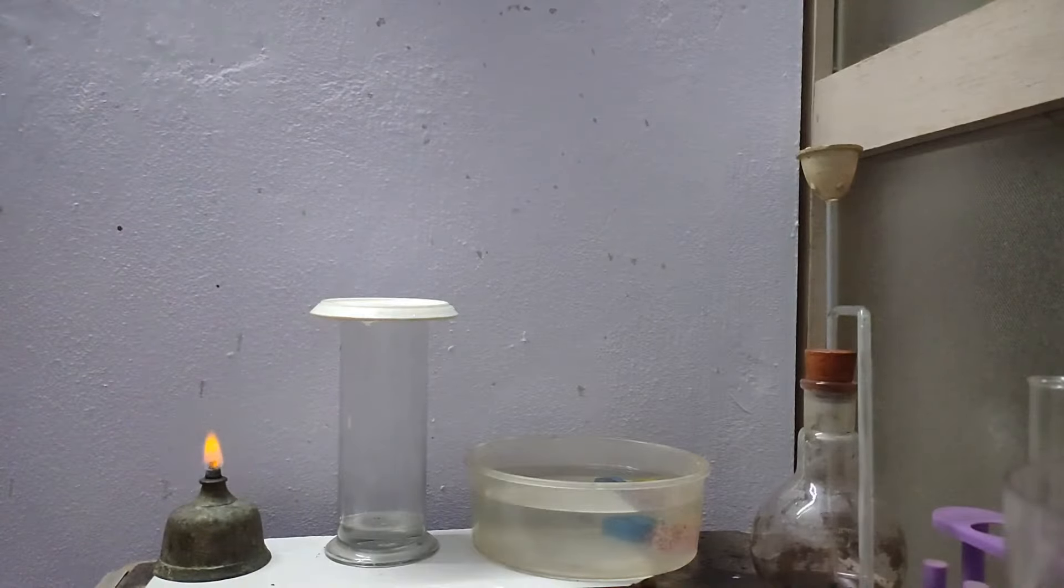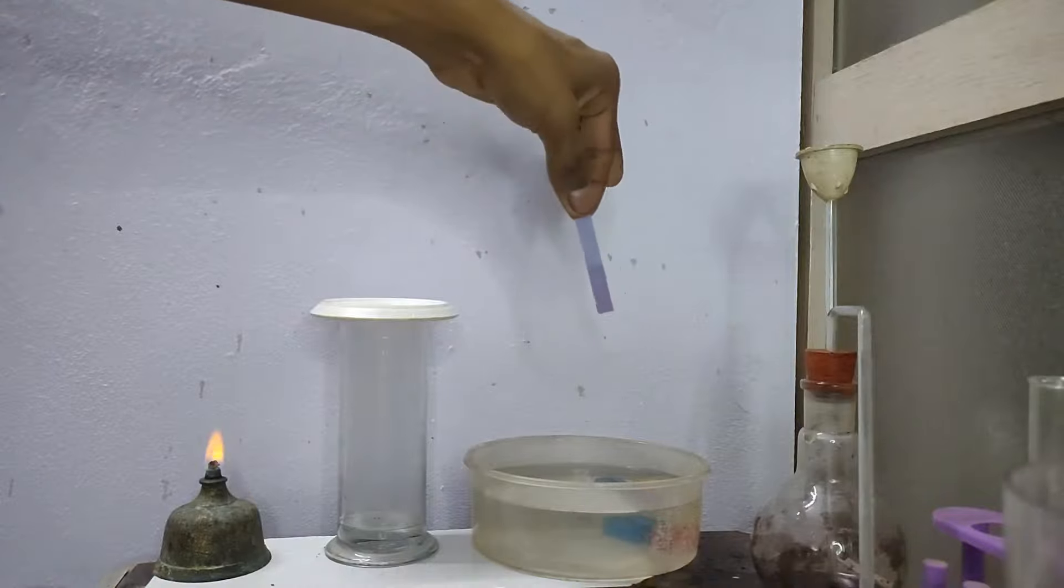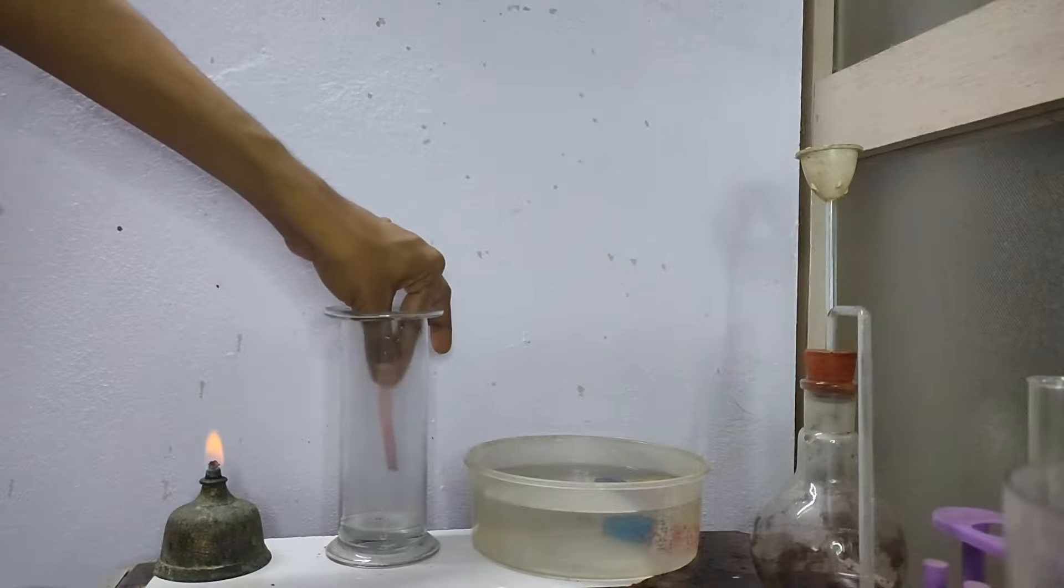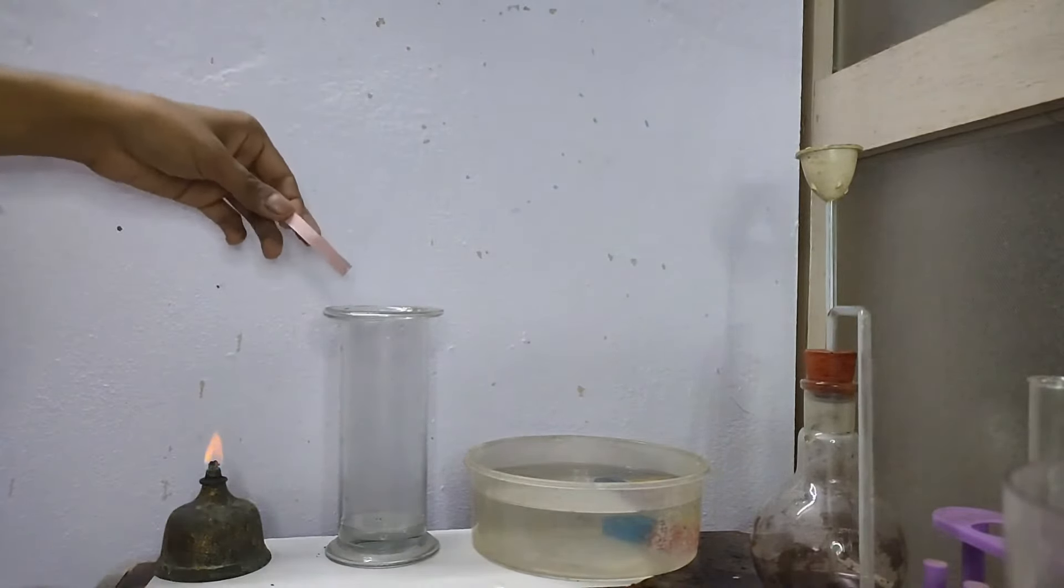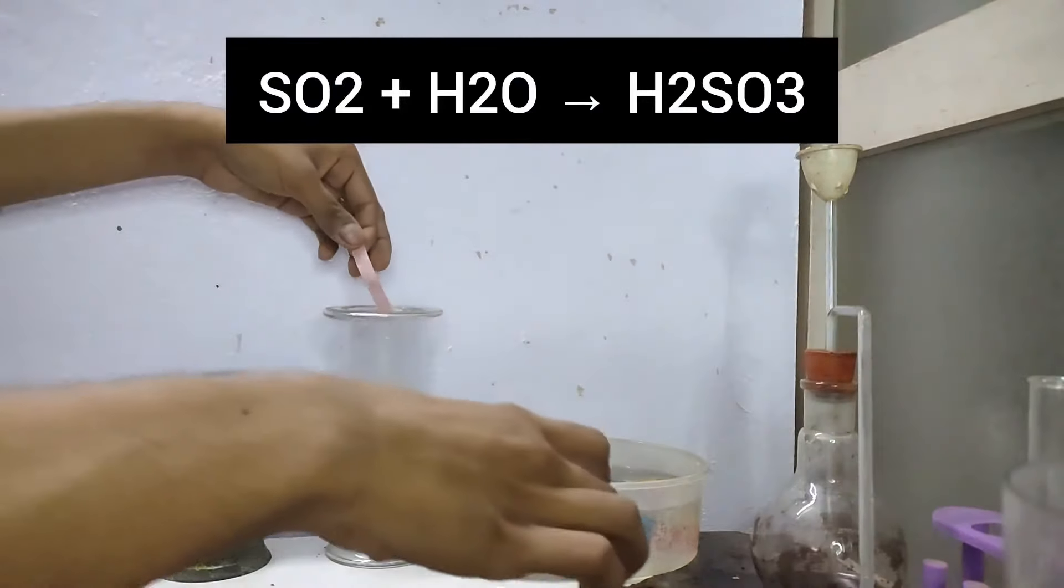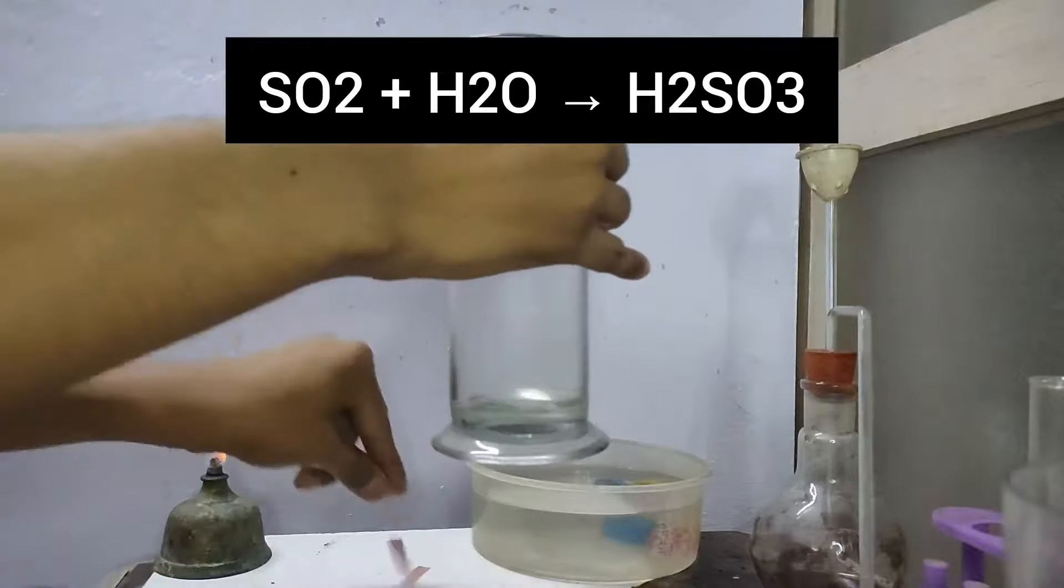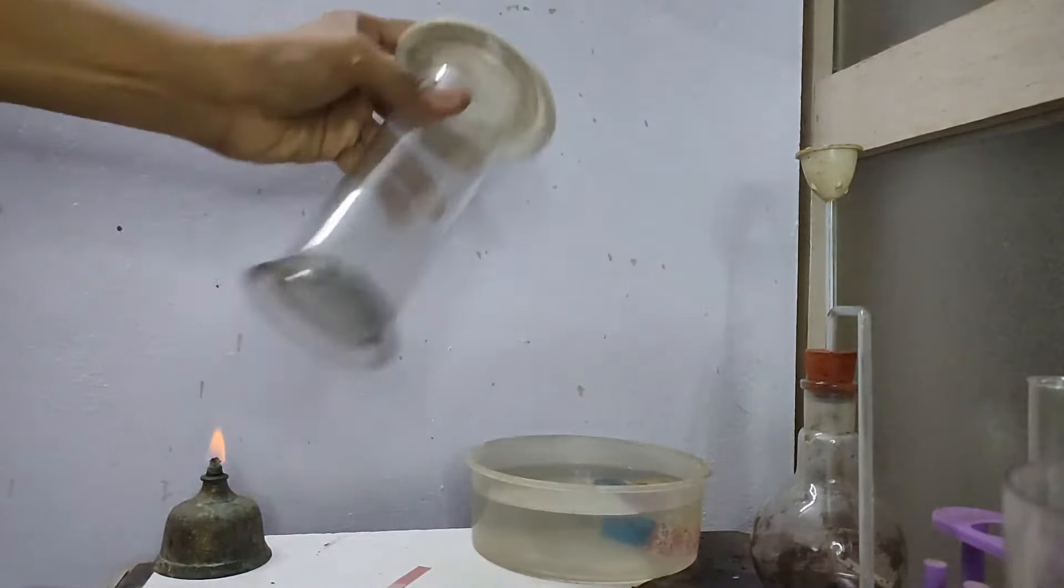To show that sulphur dioxide is acidic gas, I am taking a blue litmus paper and placing inside the gas jar and you can see that sulphur burns in oxygen to produce sulphur dioxide gas which dissolves in water to give sulphurous acid. Therefore, it turns blue litmus paper red.